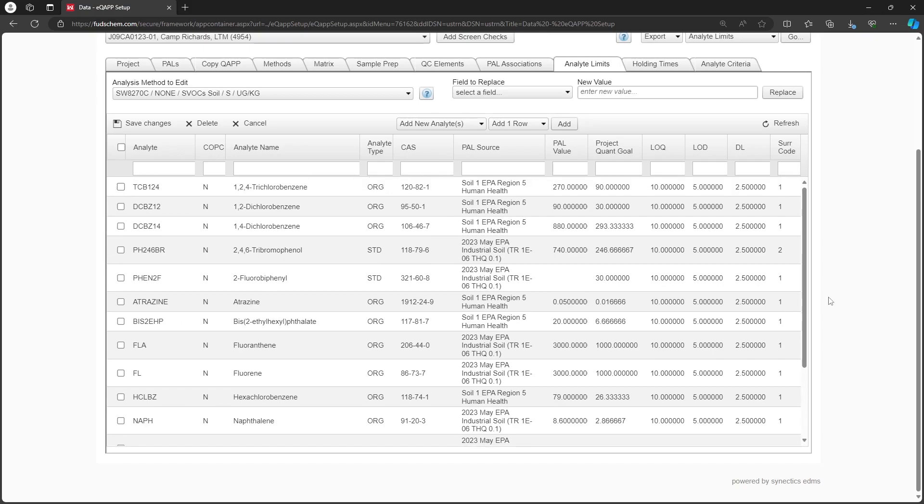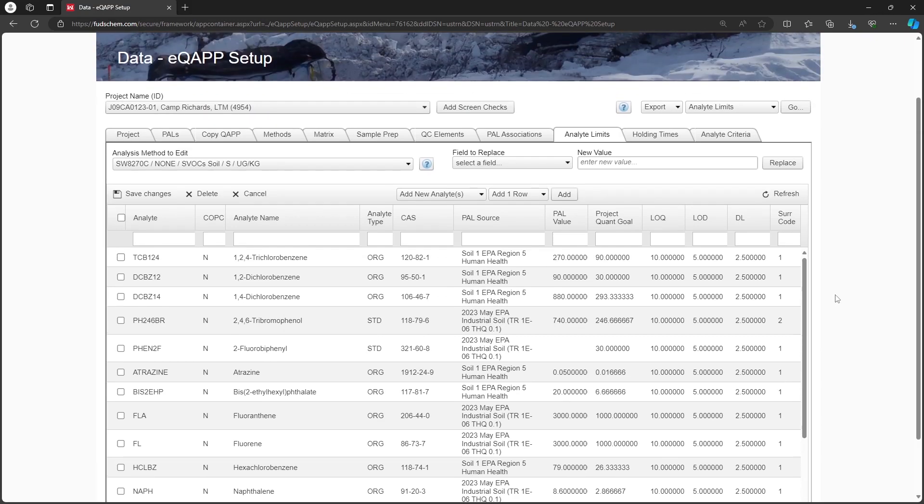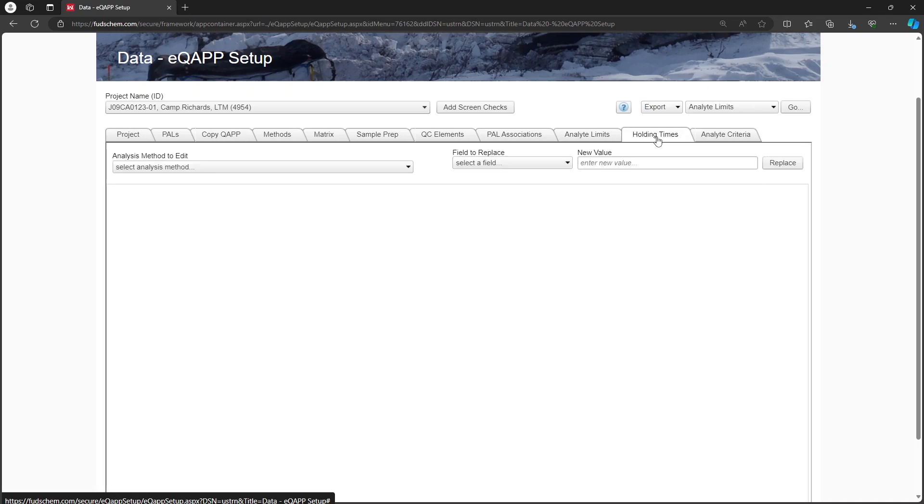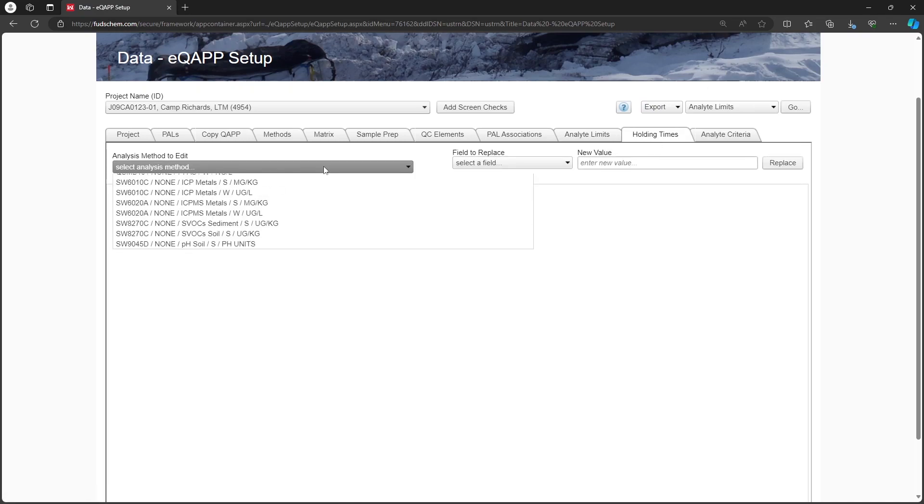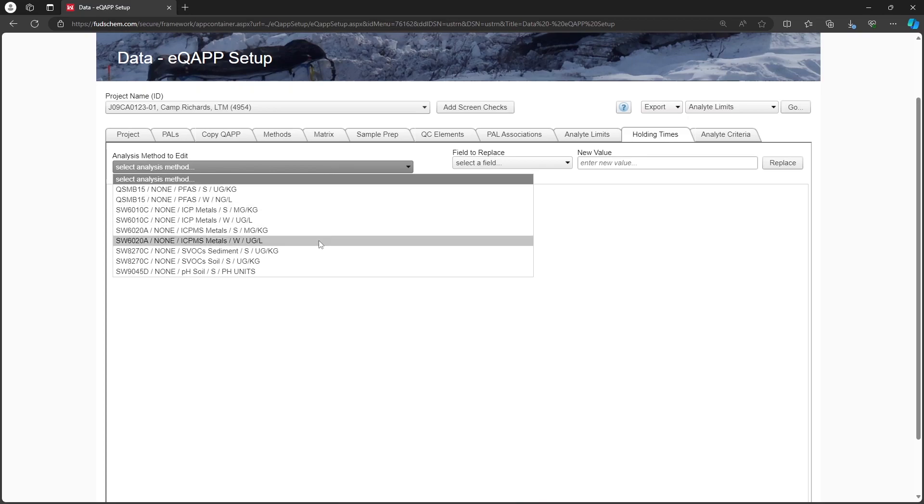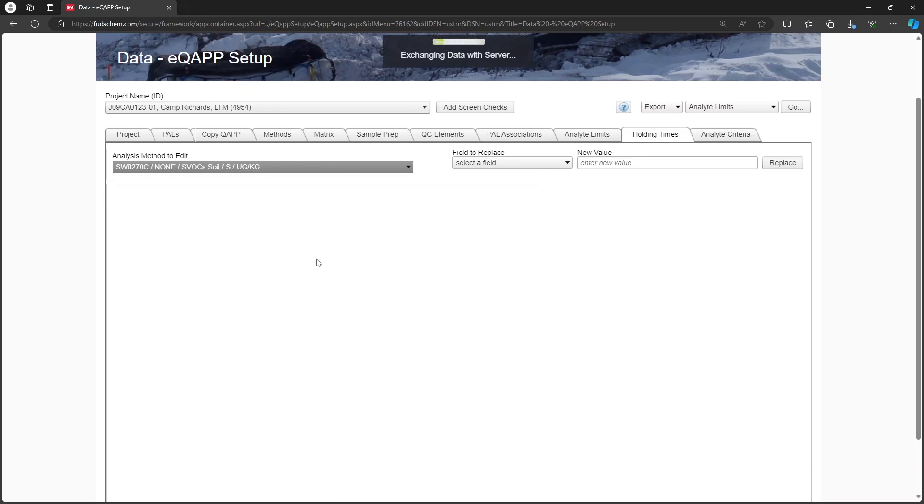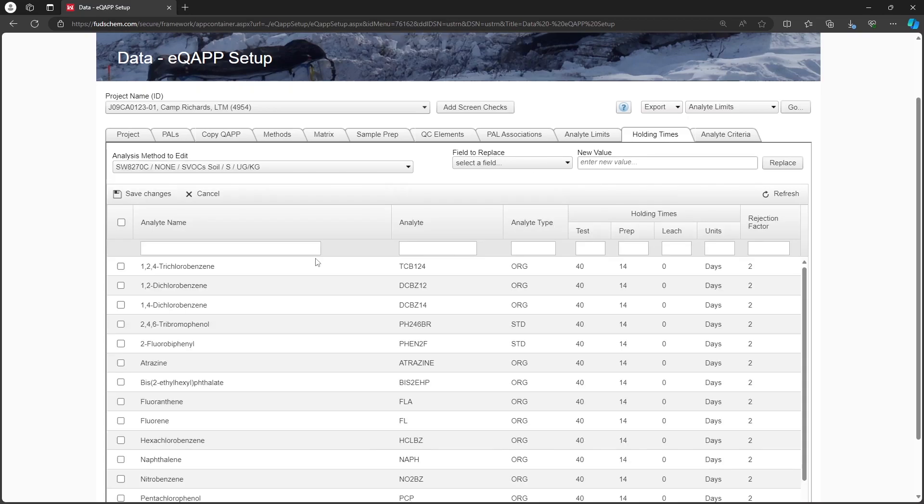Let's go to the Holding Times tab next. Select the Analysis method to edit. In this case, our SW8270C soil method.